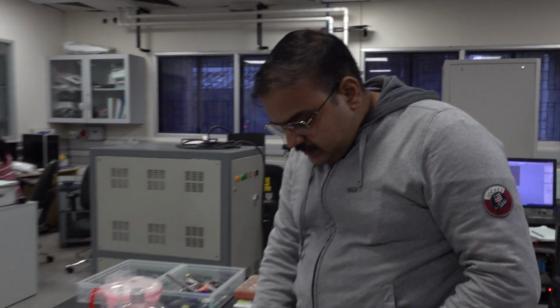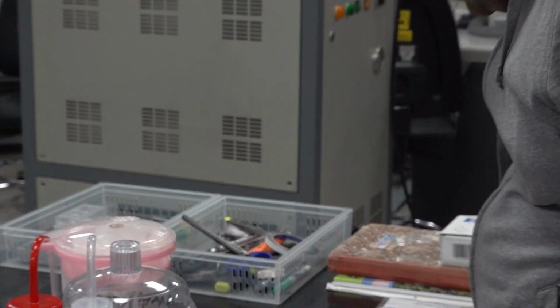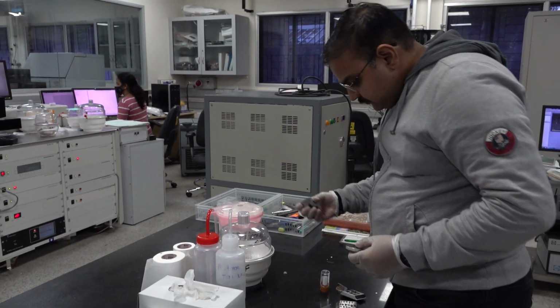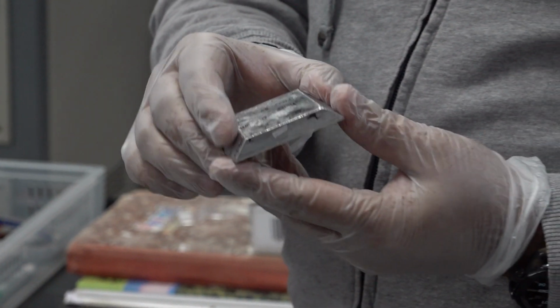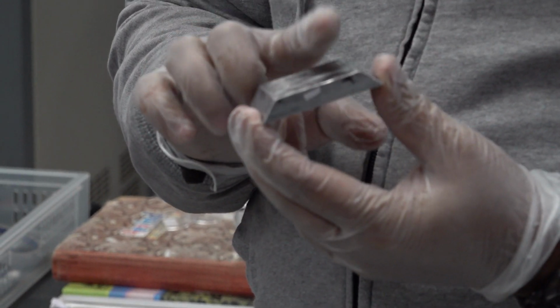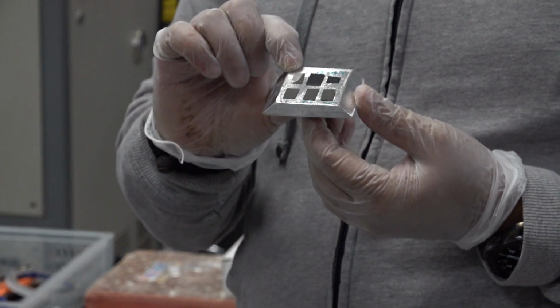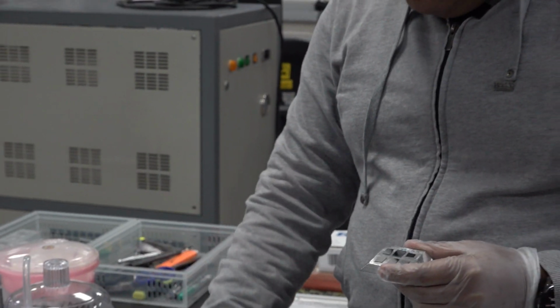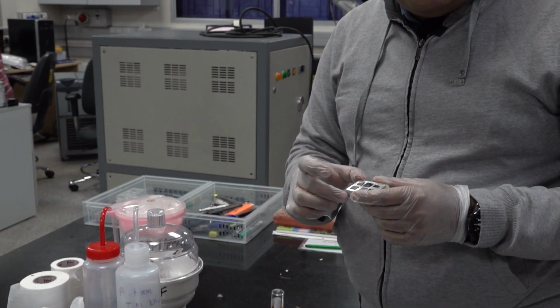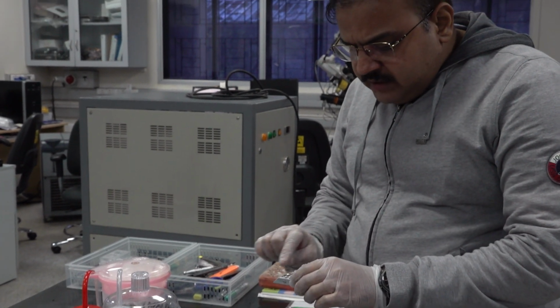As you can see here, I have different kinds of holders. These are stub holders and these are different kinds of stubs. The interesting part is that we have a flat surface where we can mount our sample like this. I have prepared a few samples for you. You can see I have pasted these films over the carbon tape. We have a double-sided carbon tape like this. We have cut a small piece, over which we have pasted your sample. Now, if you have a powder sample or any other sample, you can make this kind of sample.